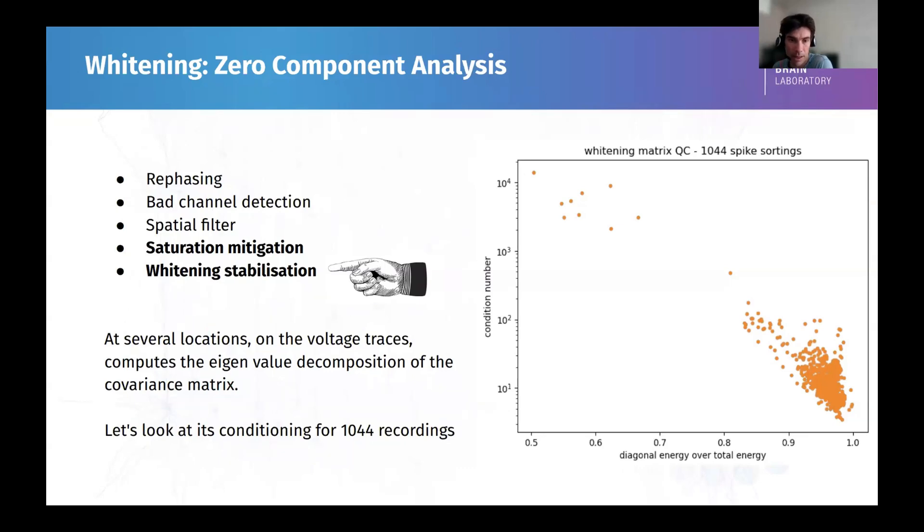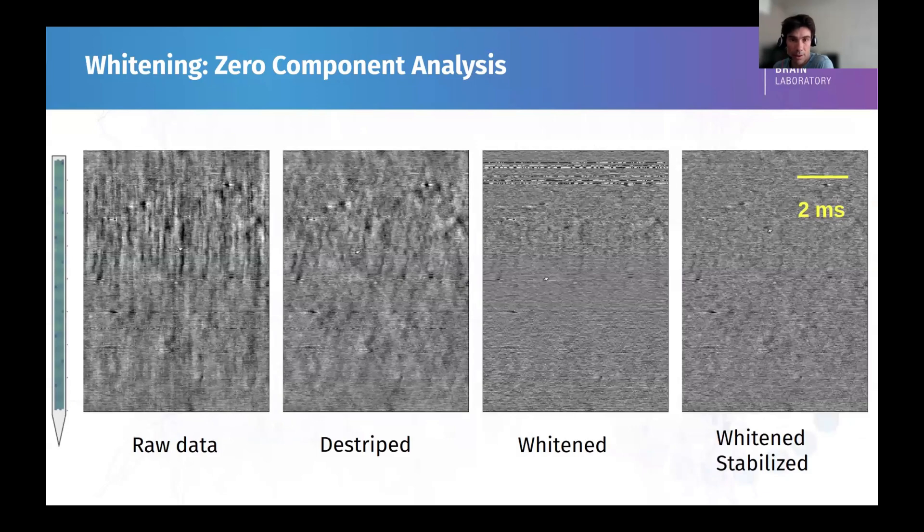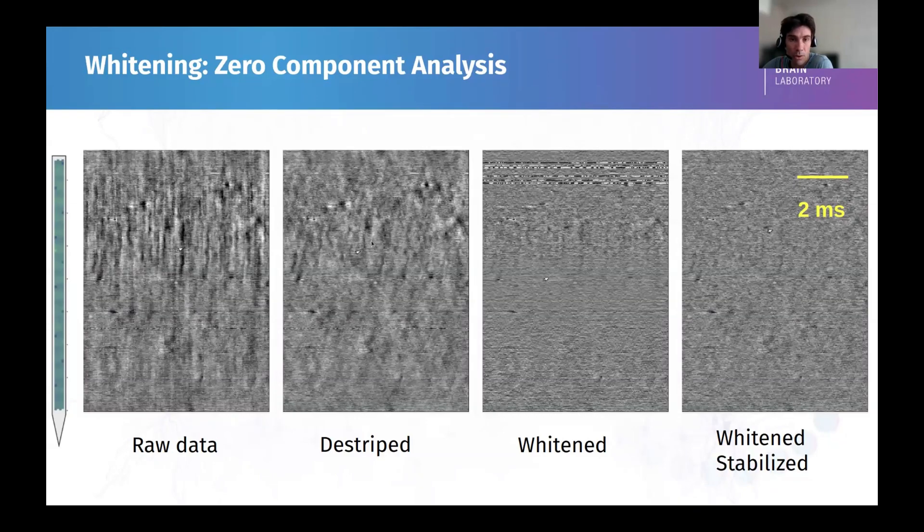And what happens here is that the data is transformed in a catastrophic way by the spike sorter, and we cannot detect any spike. So we have to stabilize a bit this inverse. And this is an example of what happens here on the raw data after the destriping or the preprocessing. And if you do a straight whitening on this dataset, you end up with very noisy channels. As you can see, the spike sorting, the clustering algorithm is operating on this whitened data, and this is not ideal at all.